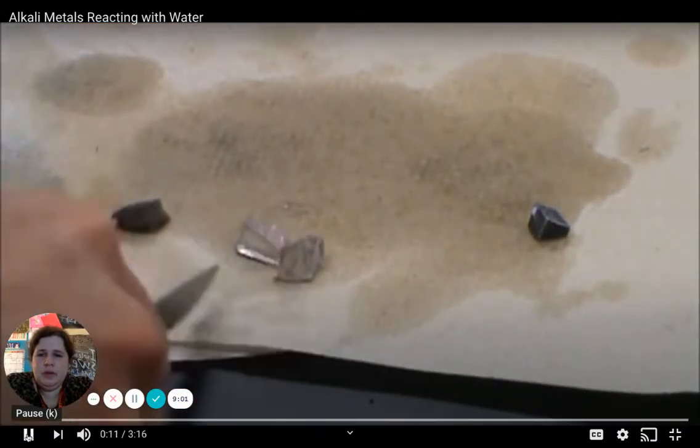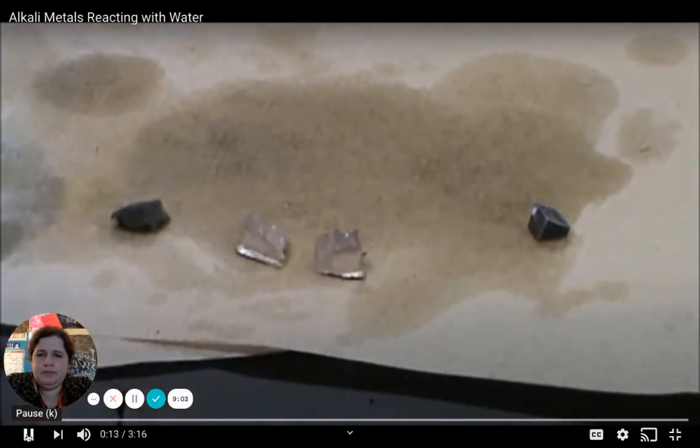You notice when I cut through that the fresh sodium is very shiny compared to the rest. So the shiny part is the inside, like right here and right here, that he just freshly cut. The more dullish gray part on the top is the part that was already up there that's been oxidized already. Okay, so if you recall, one of the properties of the alkali metals, group 1, is that they are very soft. They can easily be cut with a knife, which is what he's demonstrating right here.